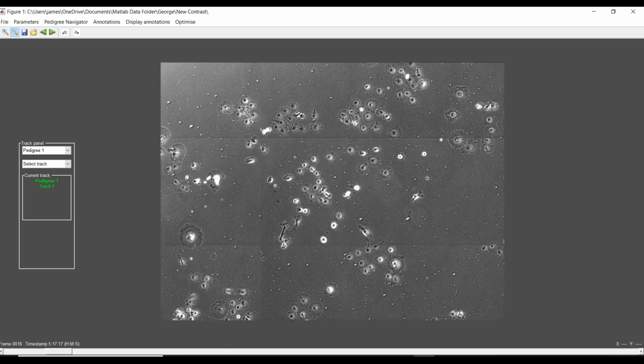In this training video, I'll illustrate cell tracking using TrackPad. After you've loaded the image stack and a track file, if it exists, you start a new track by using the mouse to right-click over the image. First of all, let's say we want to track this cell down here.